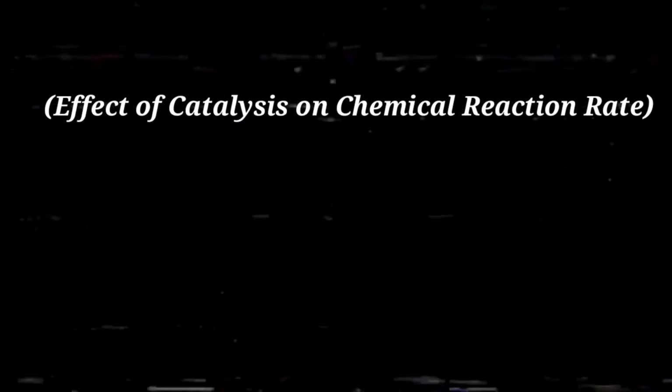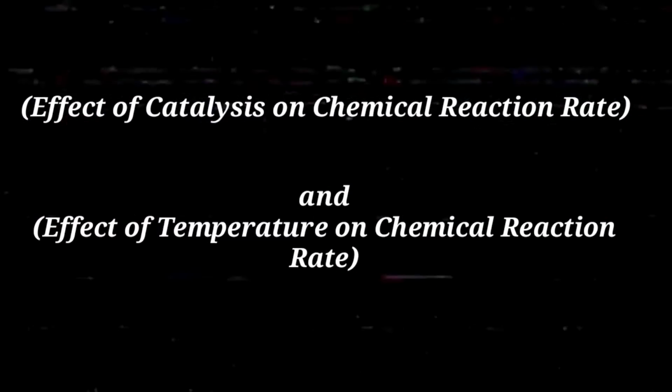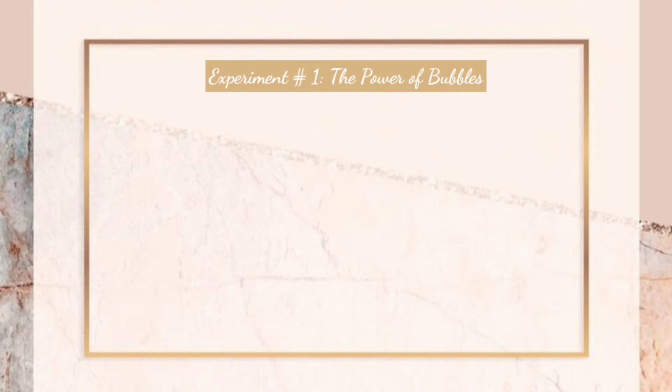For today's content, I'll give an experiment to show you the effect of catalysis on chemical reaction rate and the effect of temperature on chemical reaction rate. So here's the first experiment, the power of bubbles.